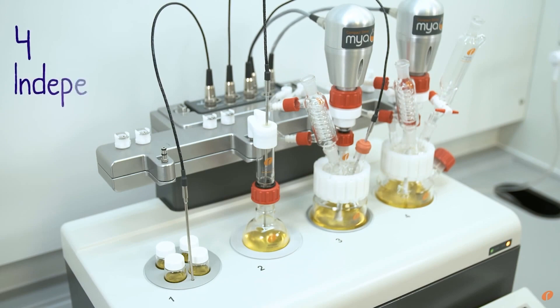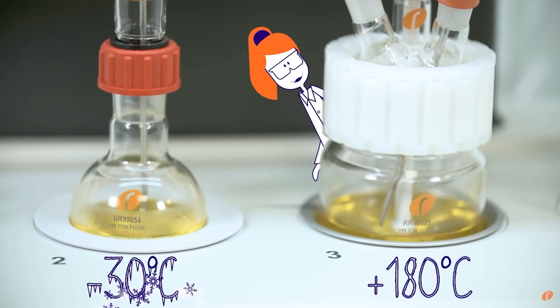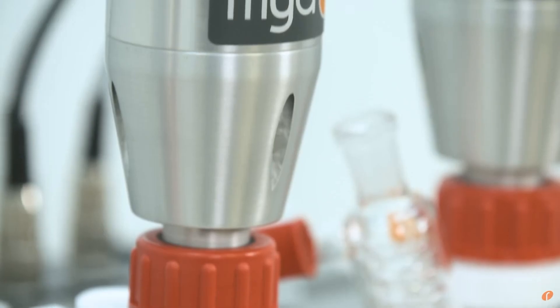Additionally, the Maya 4 enables the bench chemist to perform multiple projects at the same time. Because all four stations on the Maya are independent, we can be operating completely different reactions, and this frees up time and increases our throughput for the resins. The Maya 4 ticked all of those boxes at a good cost point.